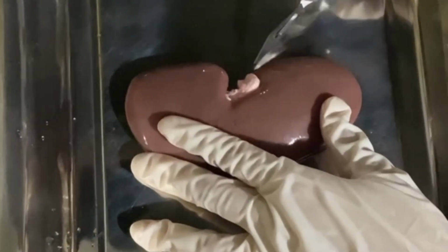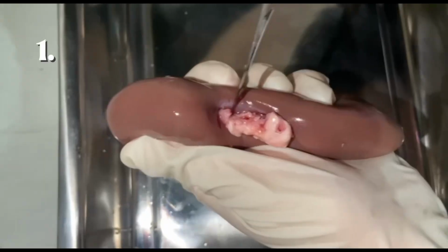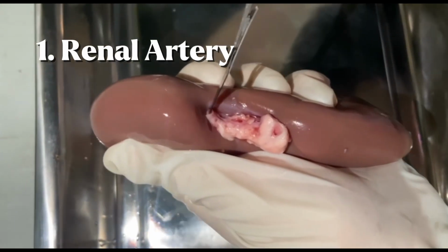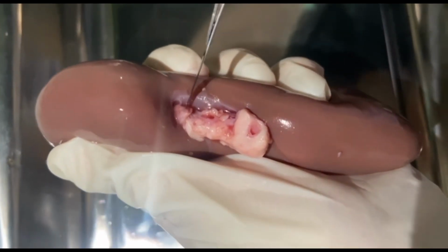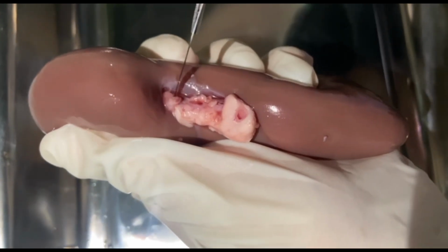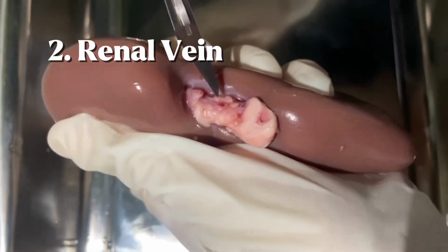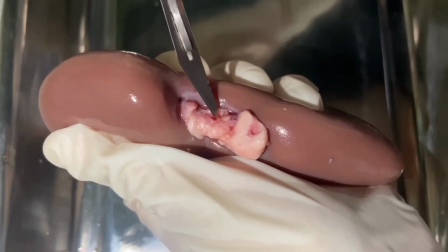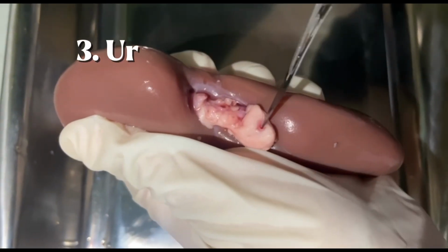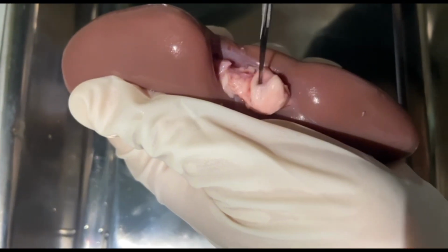The indented part is the hilum region, which contains three structures. The renal artery carries oxygenated blood from the heart to the kidneys for filtration. The renal vein transports the blood away from the kidneys back to the heart. And the ureter transports urine from the kidneys to the bladder for storage.